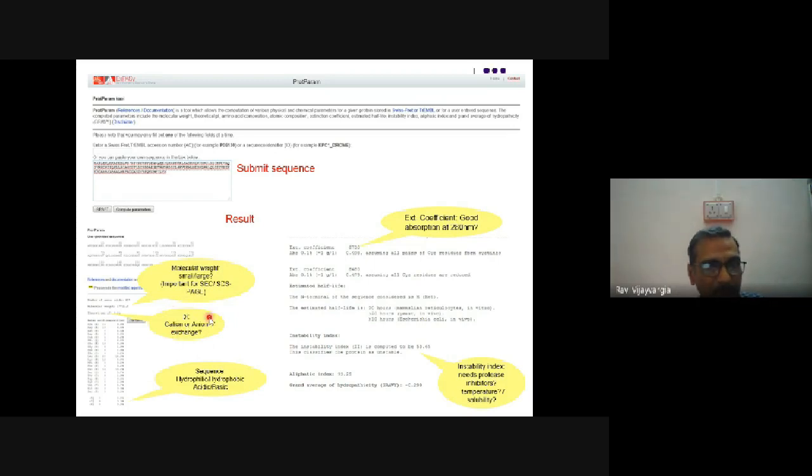So if you know the isoelectric point for your protein, then based on the pH of the buffer you are planning to use for purification, your protein can be a cation or an anion. Based on that, you can decide on cation or anion exchange chromatography. Similarly, the sequence gives you the amount of hydrophobic, hydrophilic, acidic or basic residues, and that also gives information about the net charge of the protein. And if it is a hydrophobic protein, then you can utilize hydrophobic interaction chromatography for its purification.